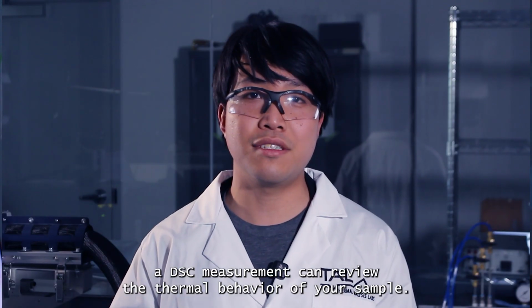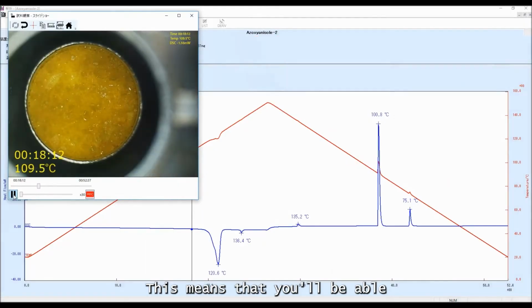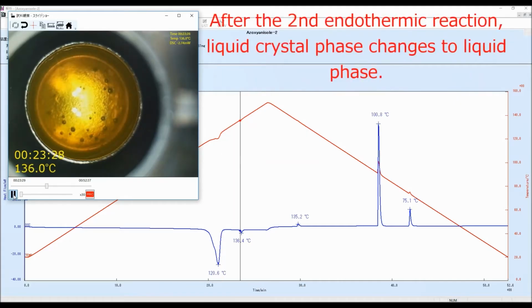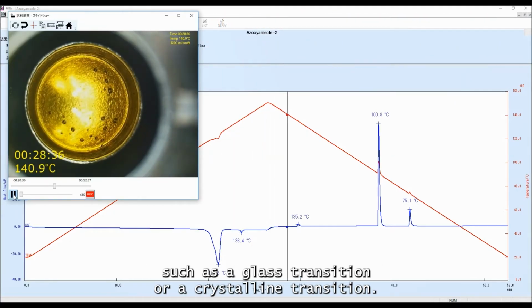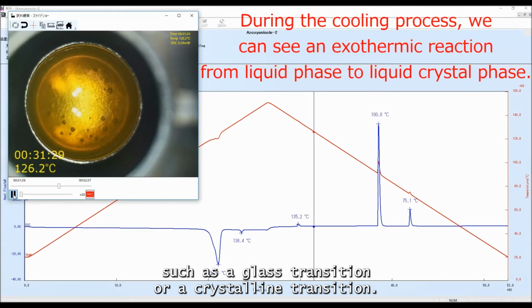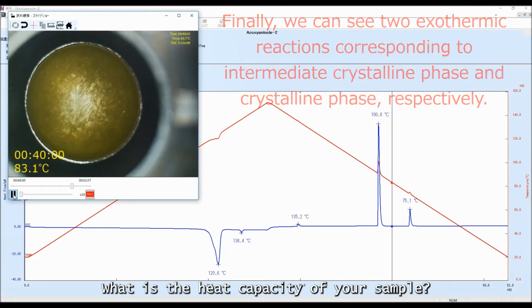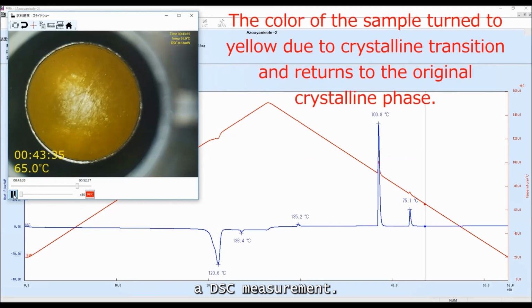A DSC measurement can reveal the thermal behavior of your sample. This means that you'll be able to understand what happens to your sample at different temperatures. Does your sample melt? Does it undergo a phase transition, such as a glass transition or a crystalline transition? What is the heat capacity of your sample? These are some of the questions that can be answered by performing a DSC measurement.